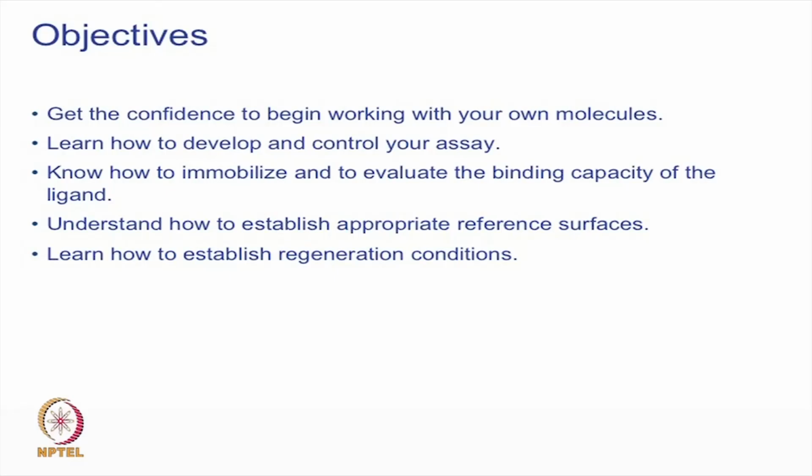In this session, we will understand how we can develop an assay, a Biacore or a surface plasmon assay. The objectives of this particular study are to understand how to work with the molecule, how to develop an assay, control an assay, we will understand about the reference surfaces, we will also understand about the regeneration of the surfaces and all that.